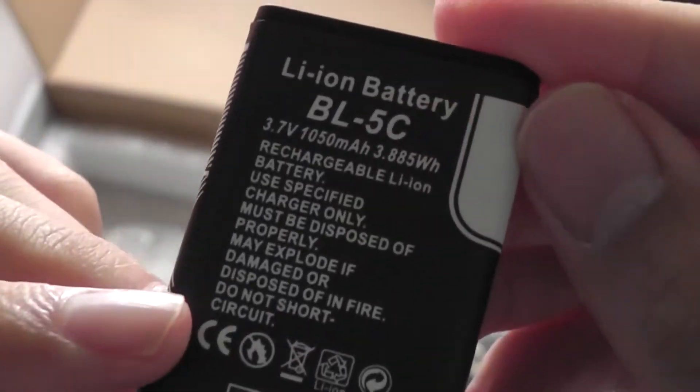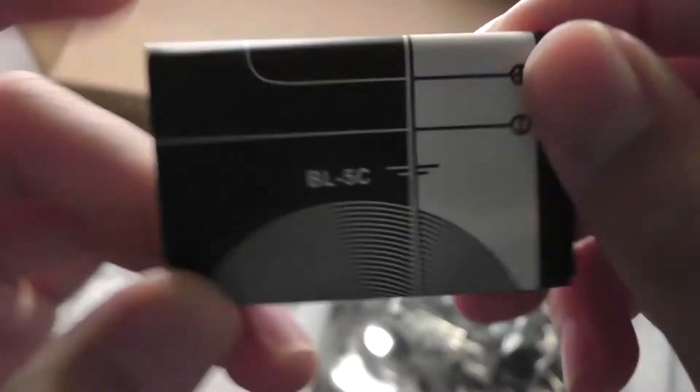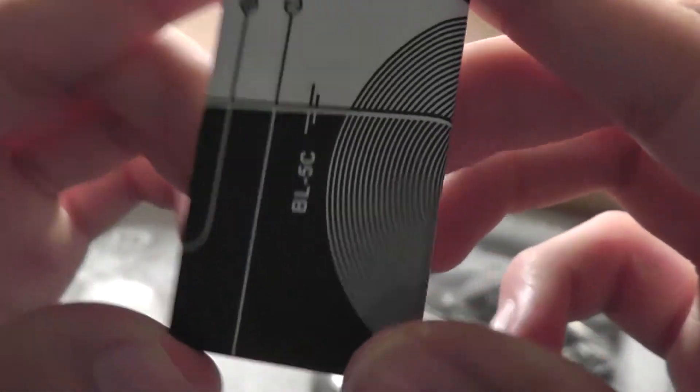It's a 1050 mAh battery, so it should get an okay amount of juice into the device.